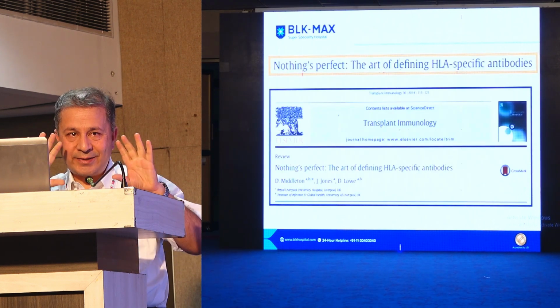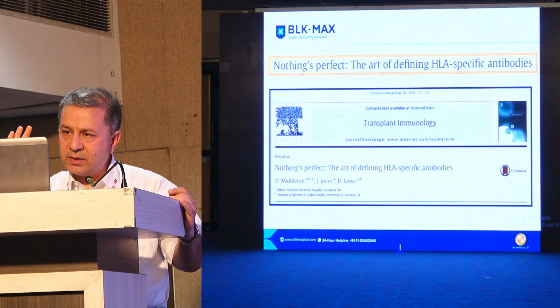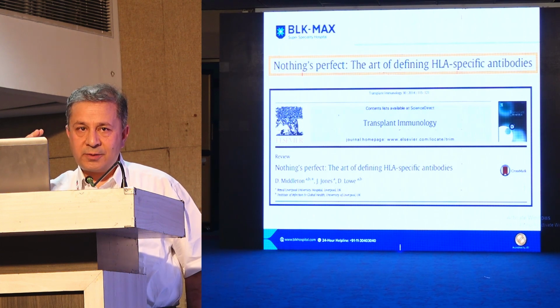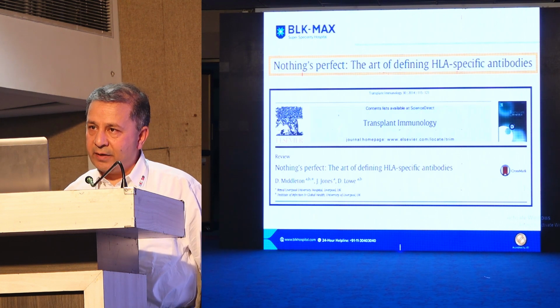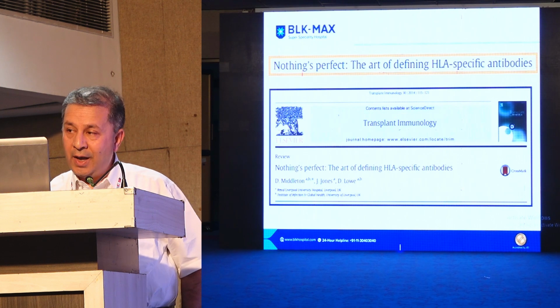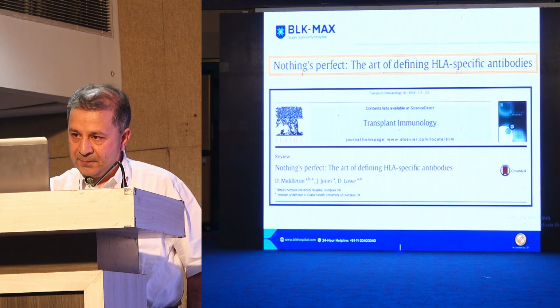But I will put it across to you in one simple article which came out quite some time ago, in 2014, and that says nothing is perfect in the art of defining HLA-specific antibodies. So even when I'm saying that flow is fantastic and gives you a much higher sensitivity, I'm not trying to obviate the fallacies which it might have associated with it.